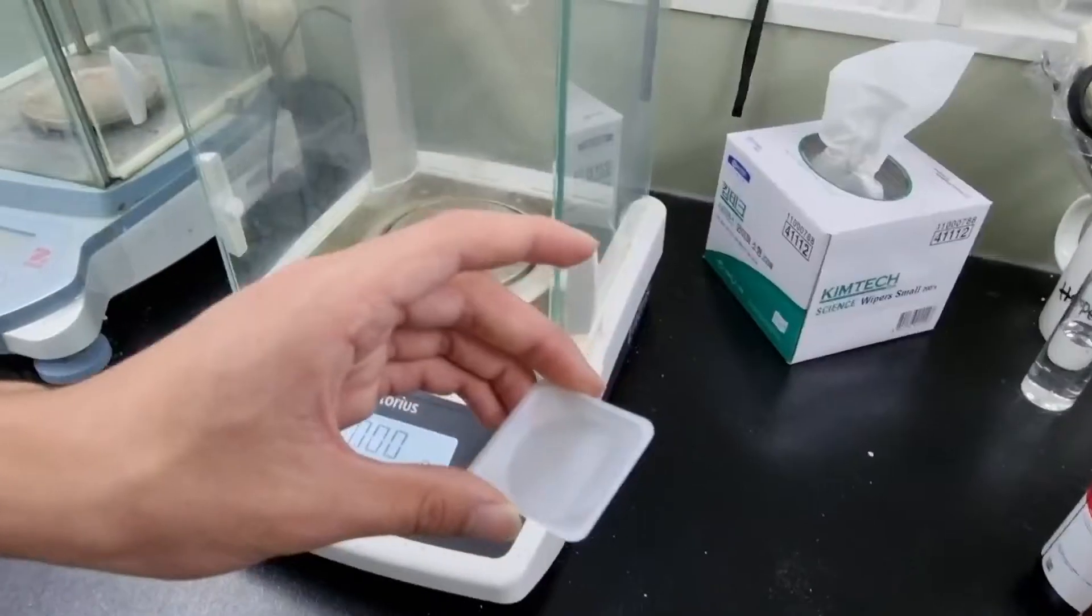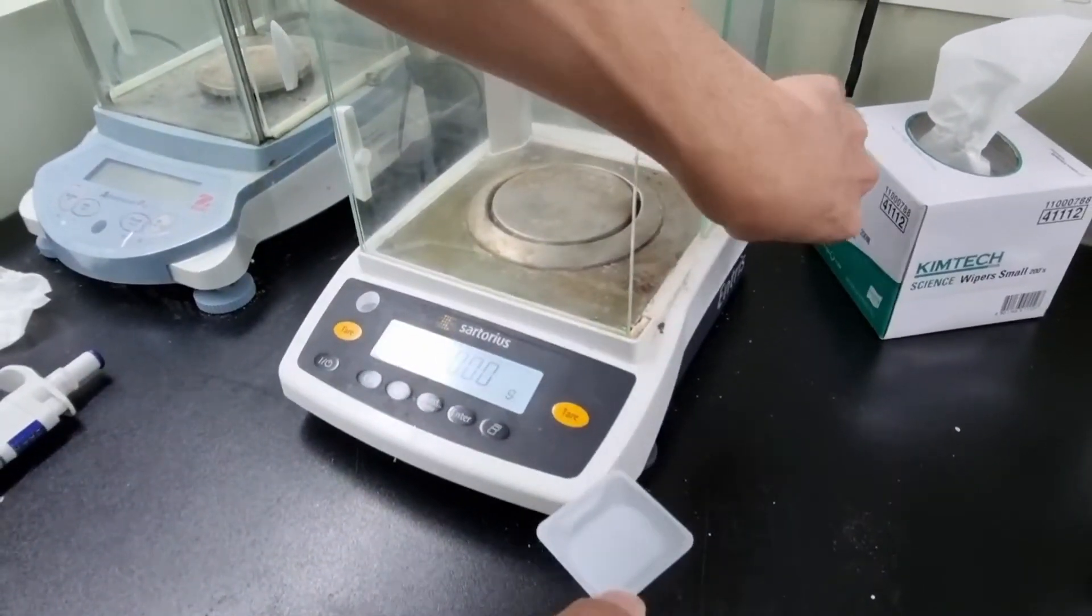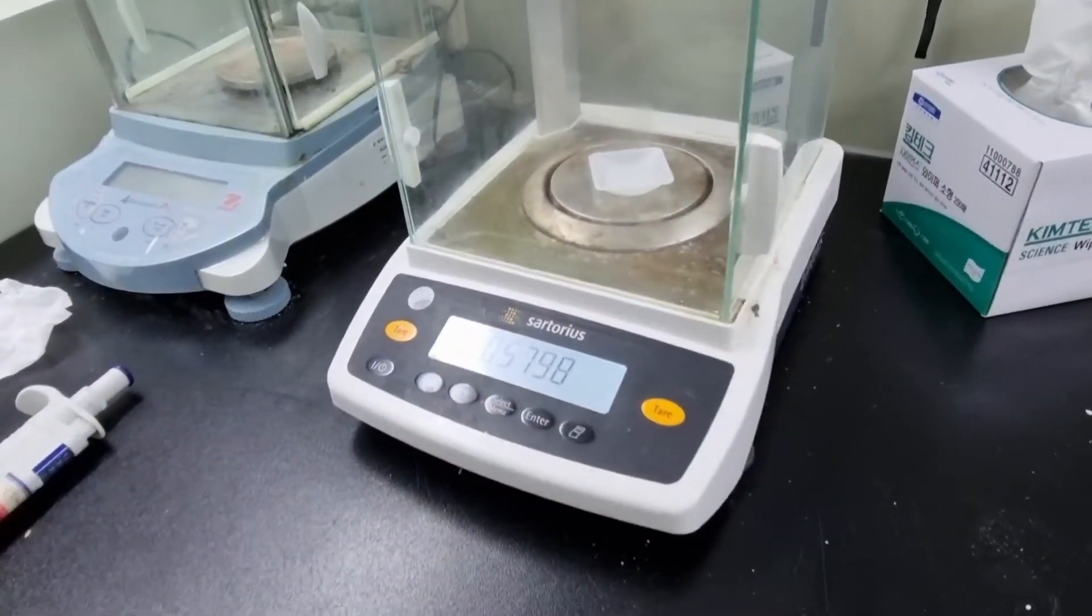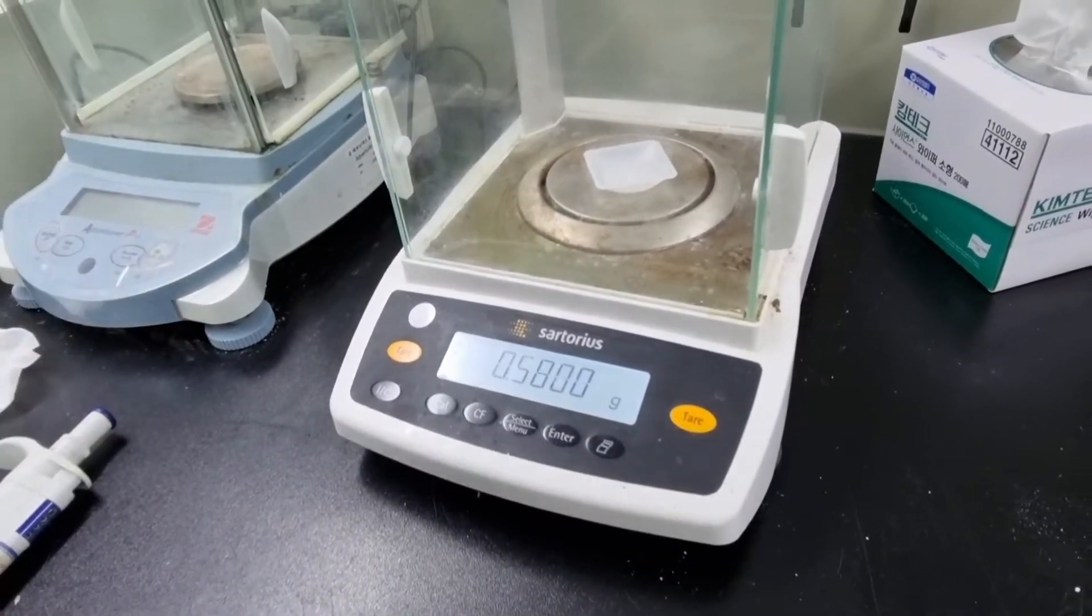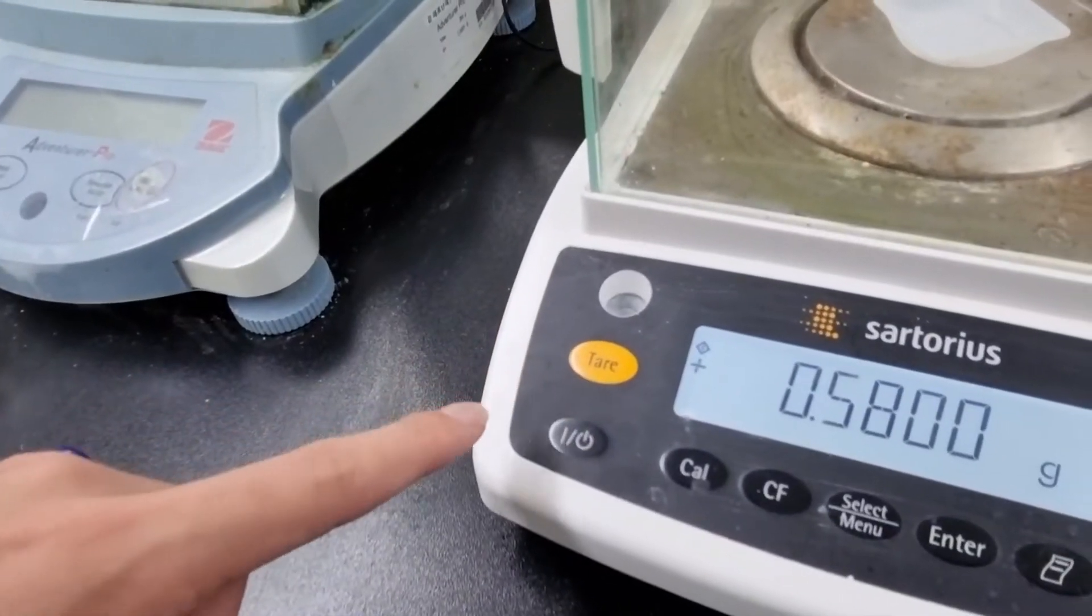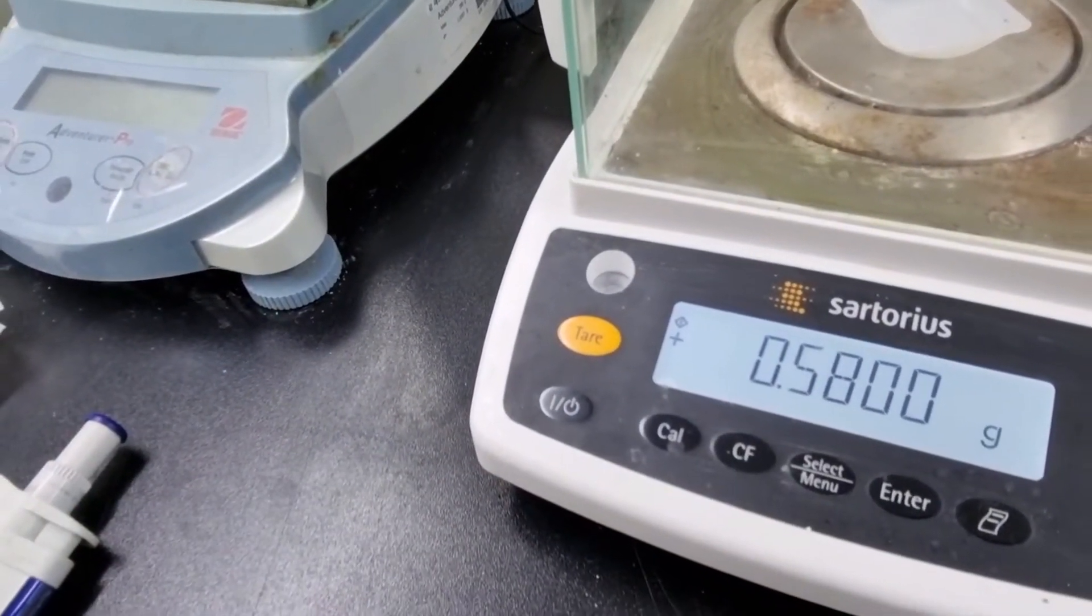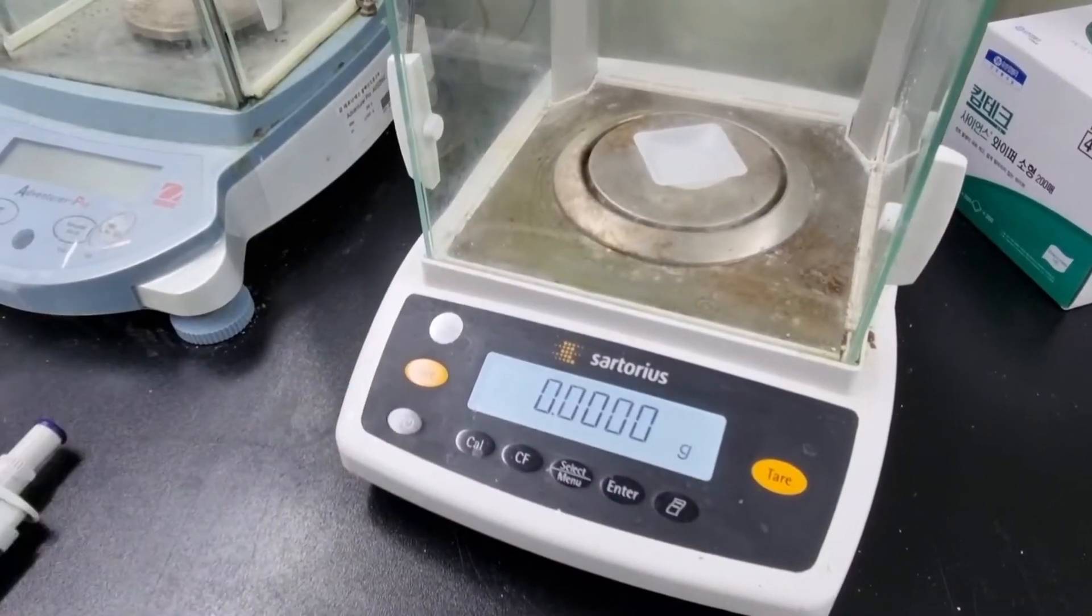And then you put the weighing dish inside the balance. And you can see that the number goes up. So it's much more convenient if you use the tare button. This is called, you use it for setting this, making it to zero, because the tare button deducts the weight of the weighing dish.